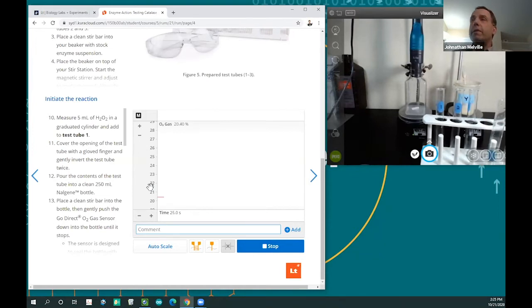And we let this run for about 2 minutes and watch it slowly increase. Oh, there we go. Increasing a little bit.